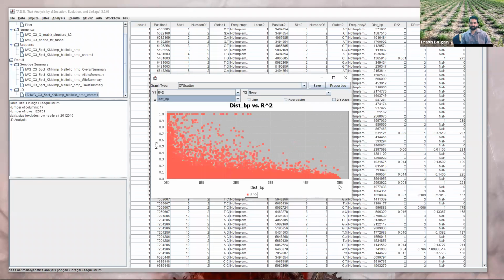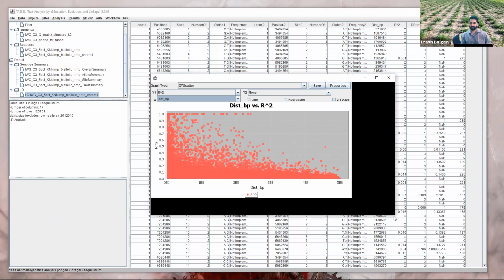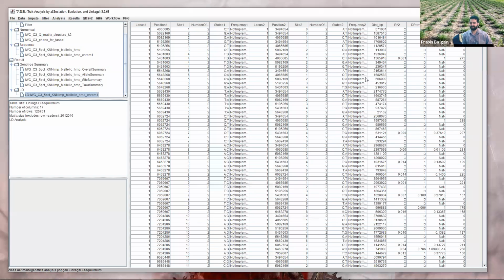Very similar looking file as you saw. It's a bad looking file for publication, but it does the job, gets the job done right now. And this is very similar to what you've probably seen in a lot of papers. Funny thing, you cannot close this, so you just got to minimize for some reason.